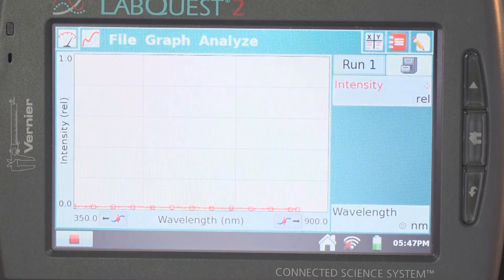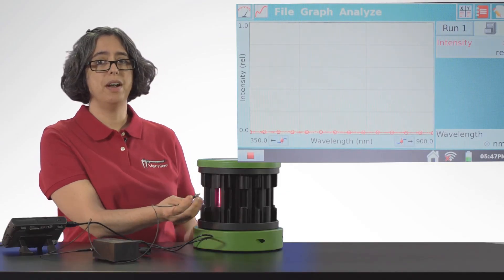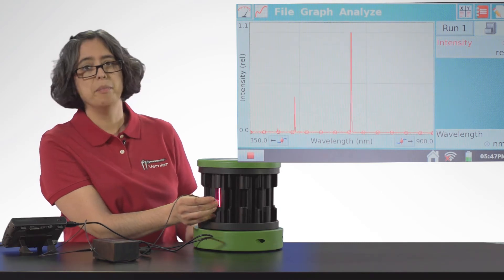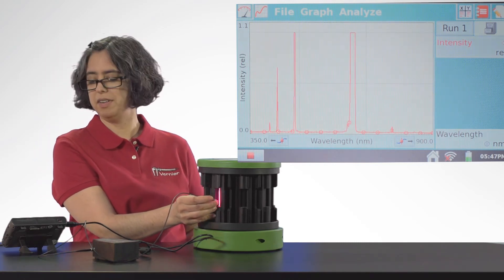Tap collect to start taking measurements, then position the other end of the fiber at the gas spectrum tube and manipulate the position until you see a good set of data.